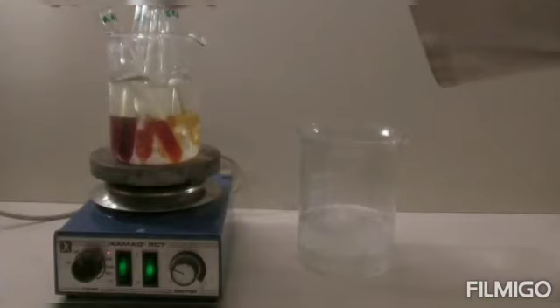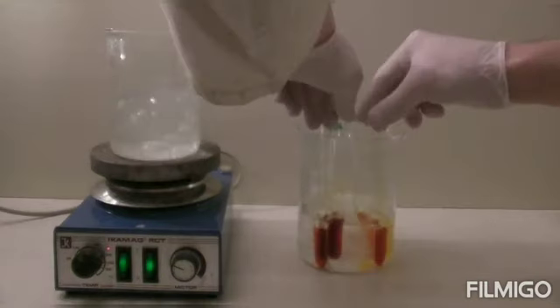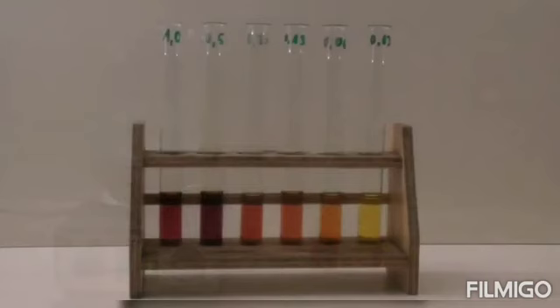After boiling, remove all test tubes and keep them in cold water. Remove all the test tubes from cold water, and here we can observe the color change.